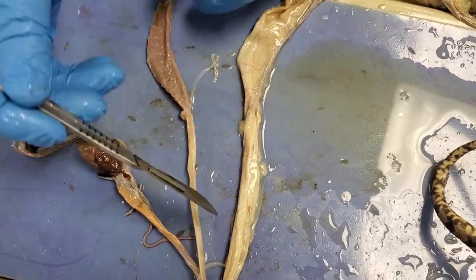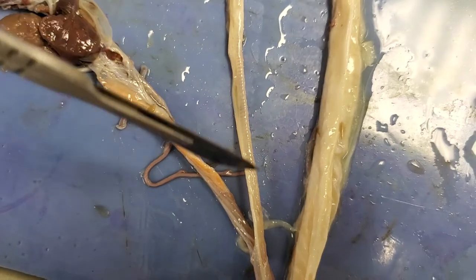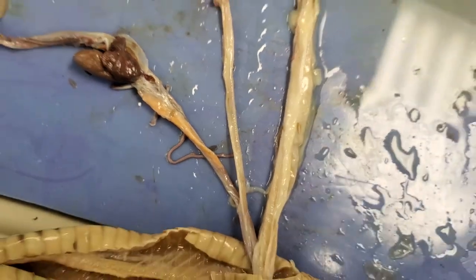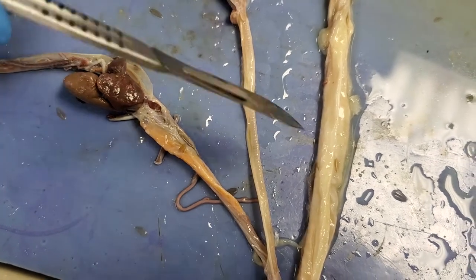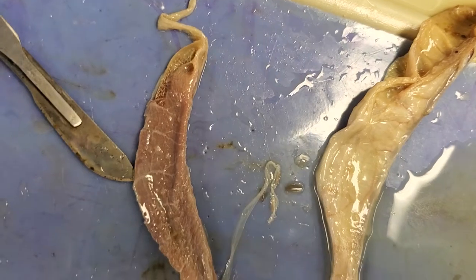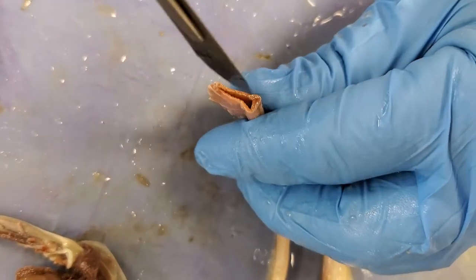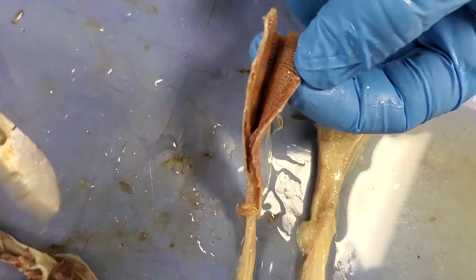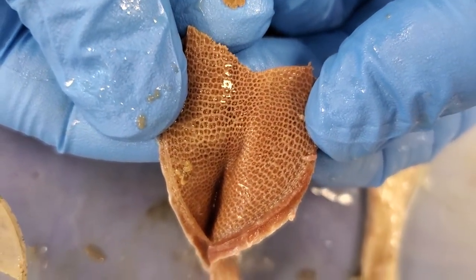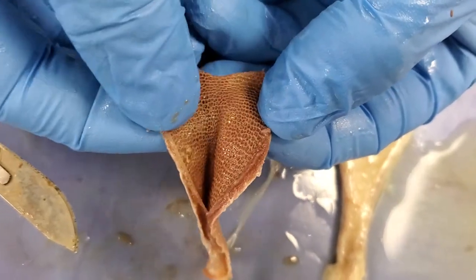Moving on over here, this is the trachea. If you look really closely, you can see all those little ridges — and you can feel those ridges in the neck of your own trachea too. They're made of cartilage and it keeps the windpipe open, like the little rings on the hose of a vacuum cleaner. Without those rings, the hose might well collapse. And this is the one lung that actually functions — it looks really cool on the inside. Whereas the liver is completely solid, this is hollow. If I take a little snip through it and open it up, you can see a honeycomb sort of structure — those are the little air sacs called alveoli where gas exchange occurs between the oxygen being breathed in and the gases in the bloodstream.